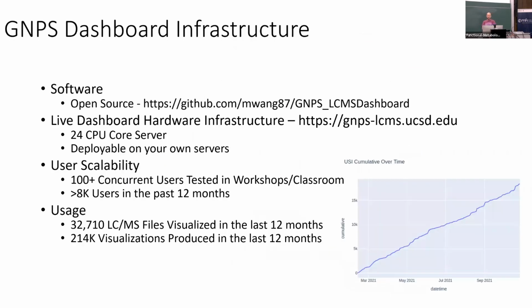And then, just a little bit of background about the software infrastructure. It's all open source. So if you want to deploy your own dashboard on your server, because you may work with clinical data, you can actually do that. We have 24 cores right now, but as Ming is moving to Riverside, there might be some changes in the hardware background.